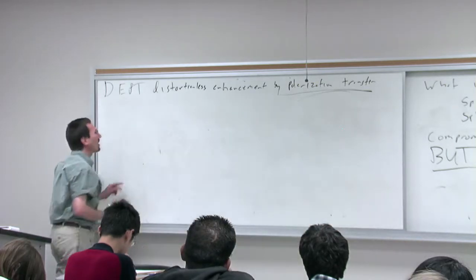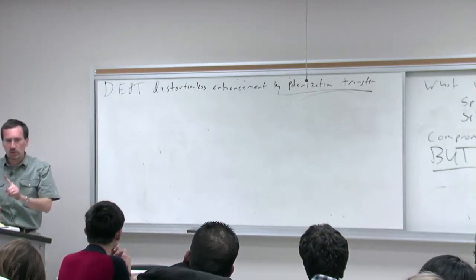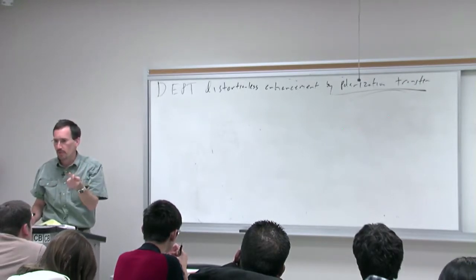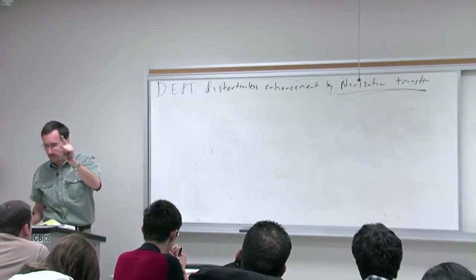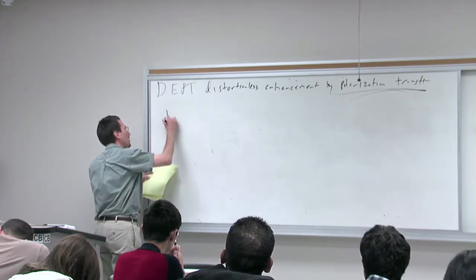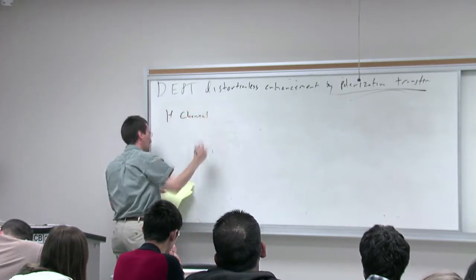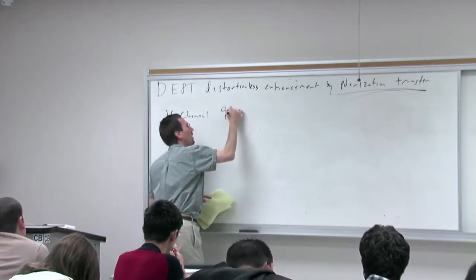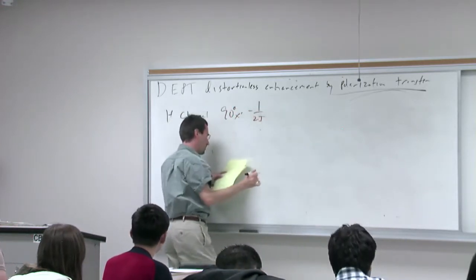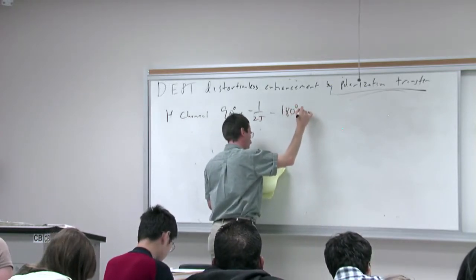Okay, so what the polarization transfer does is it flips the population of the proton and the carbon. So the carbon, in the end, through this pulse sequence, gets the bigger Boltzmann distribution of the protons. Let me just show you the pulse sequence and tell you the things that it does. All right, so here's in your proton channel, you actually start out. You apply a 90-degree X prime pulse, you wait 1/2J, you apply a 180-degree X prime pulse.